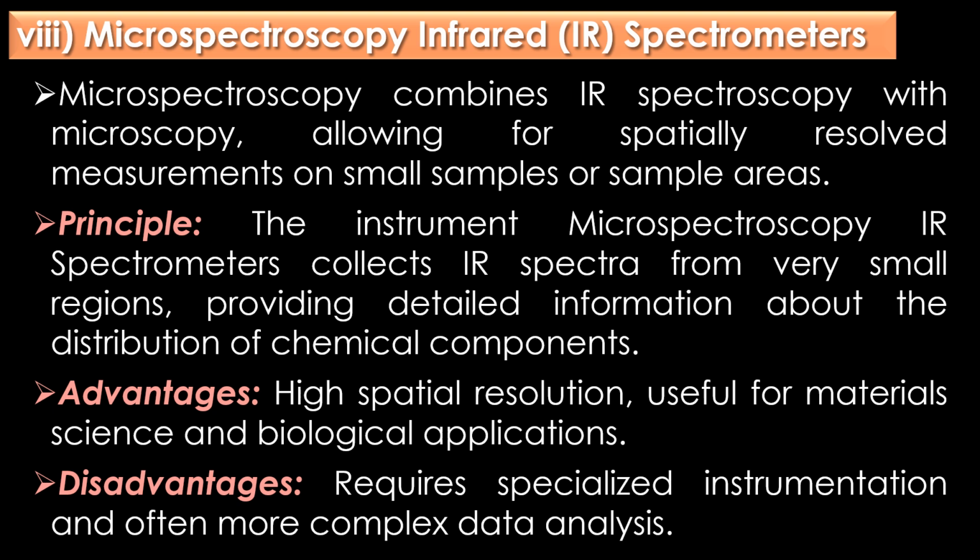Advantages: microspectroscopy IR spectrometers have a high spatial resolution, useful for material sciences and biological applications. Limitations or disadvantages: microspectroscopy IR spectrometers require specialized instrumentation and often more complex data analysis.